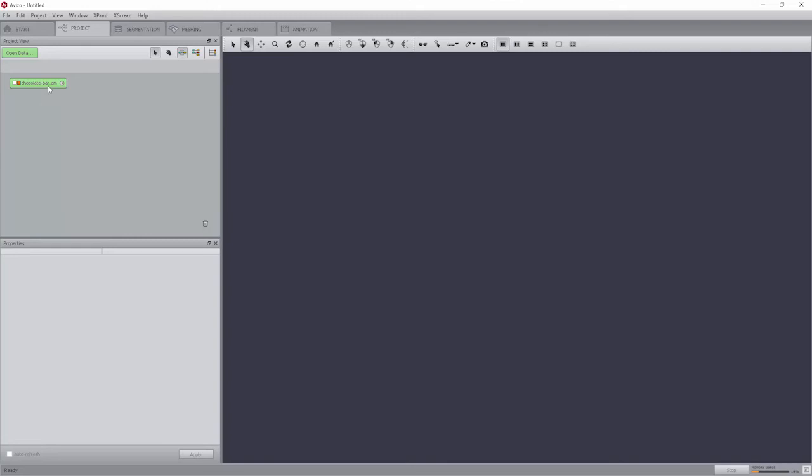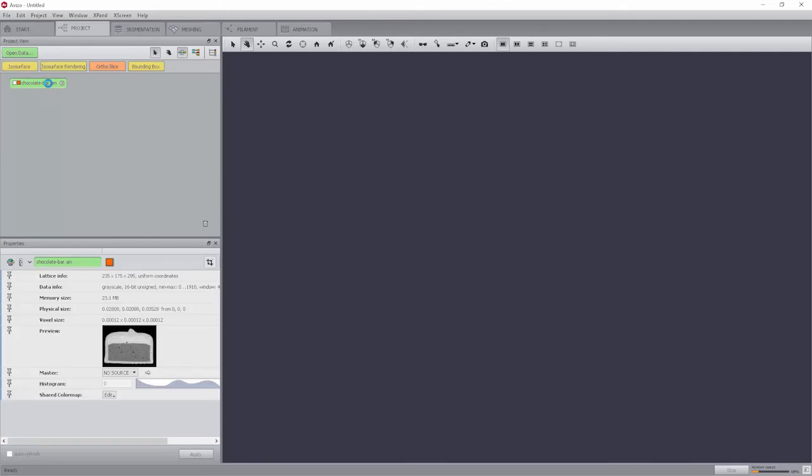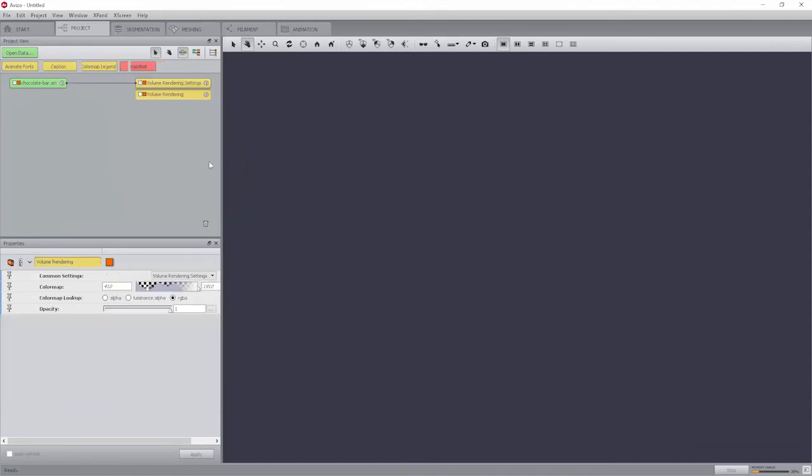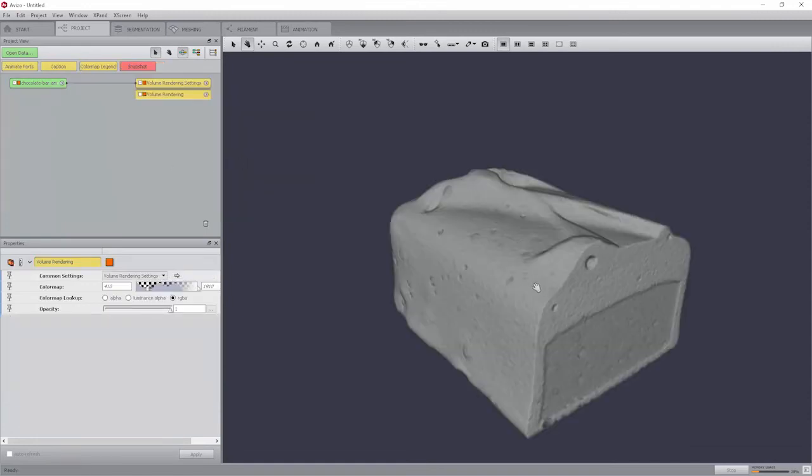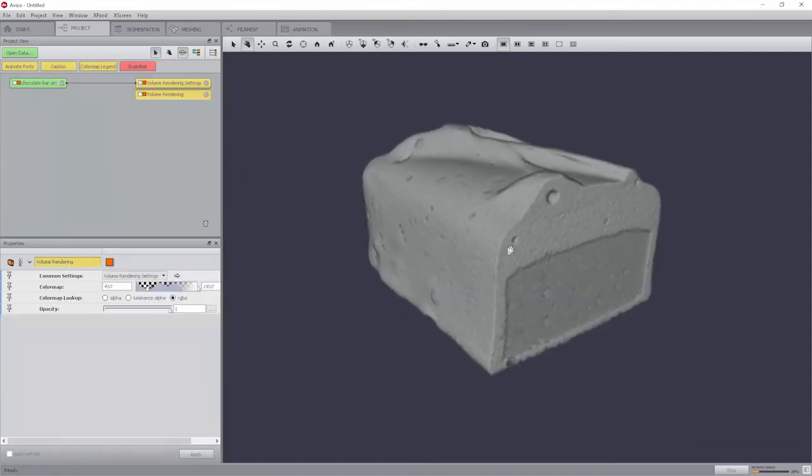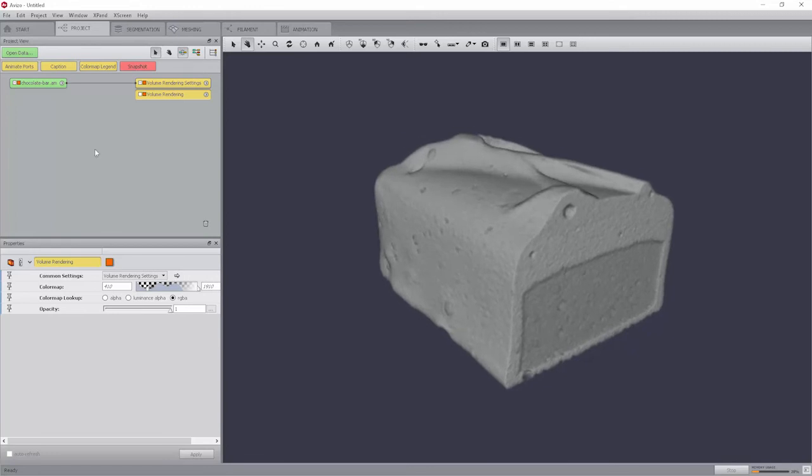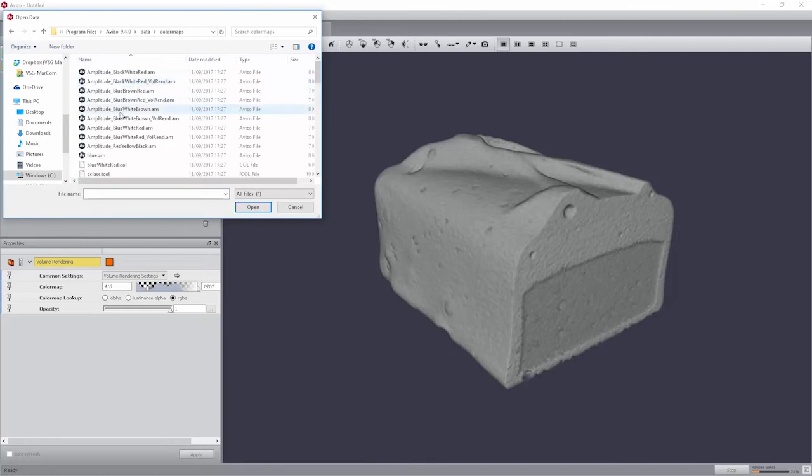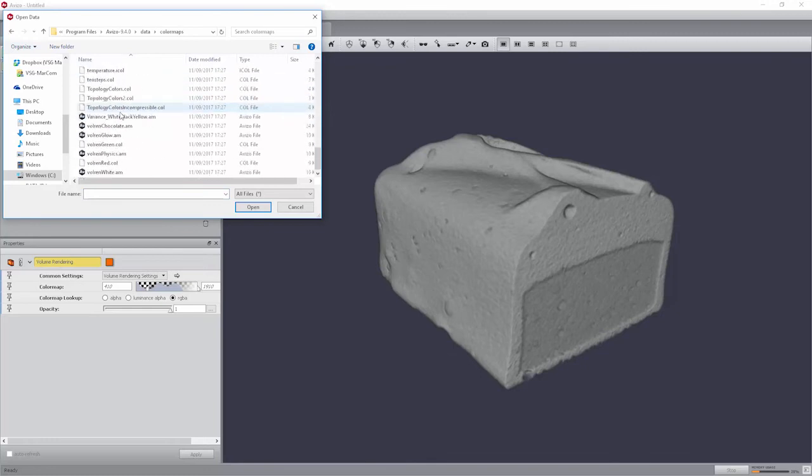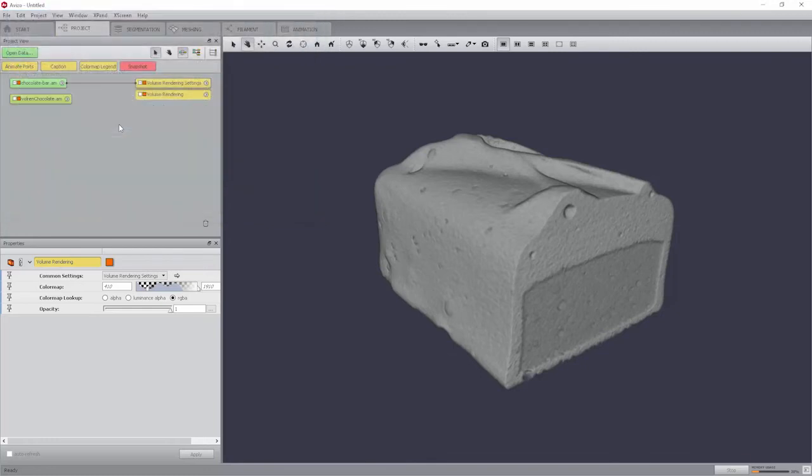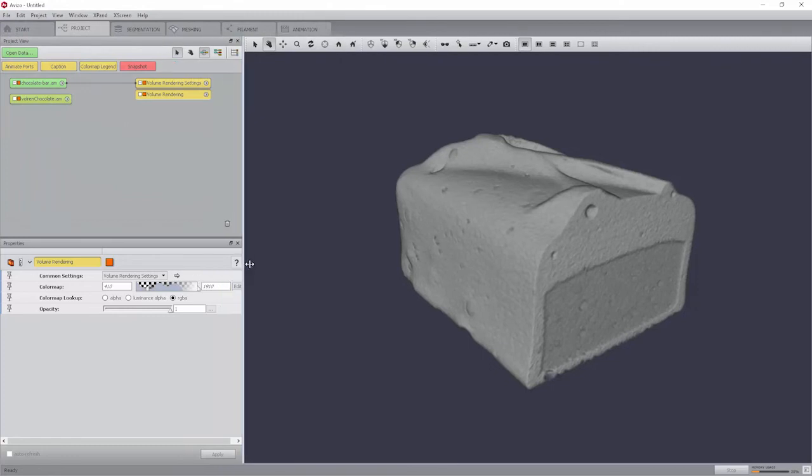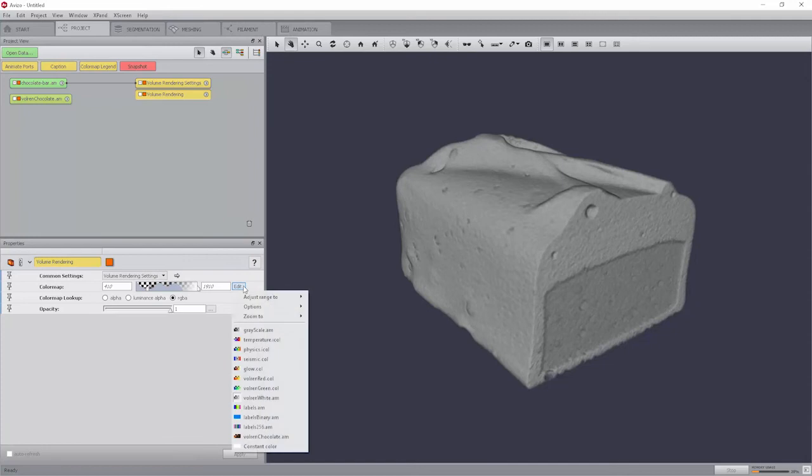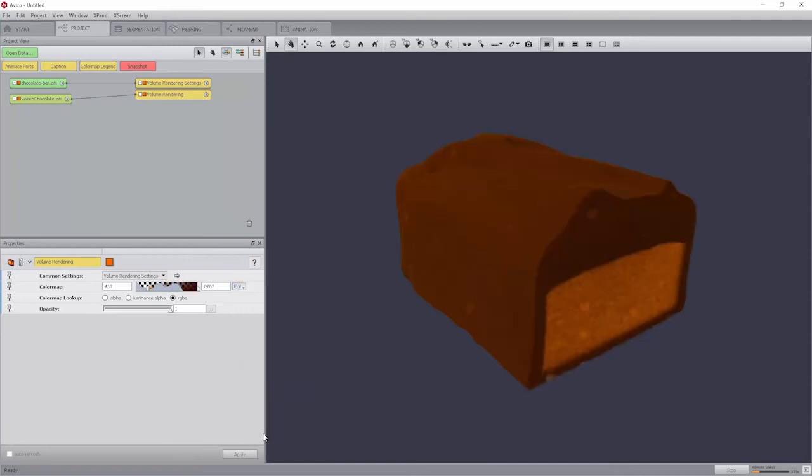Select the data icon and read off the range of the data values printed in the data info line. Connect the volume rendering module to the data. Load the chocolate color map located in the data slash color maps folder named volrentchocolate.am. Change the color map of the volume rendering module. To do so, in the color map port, click on edit and select volrentchocolate.am.